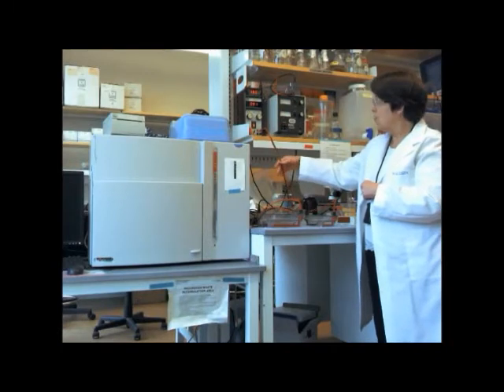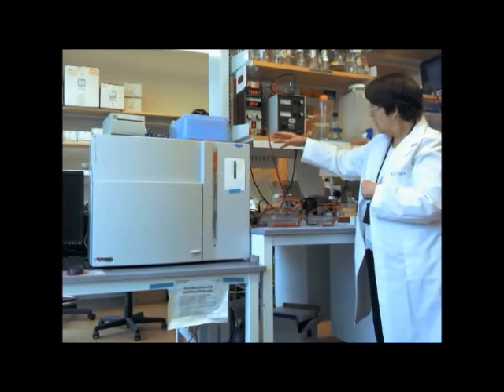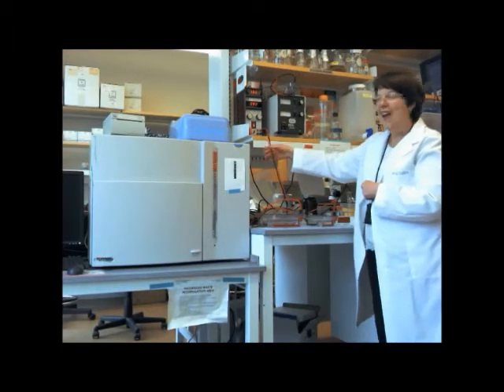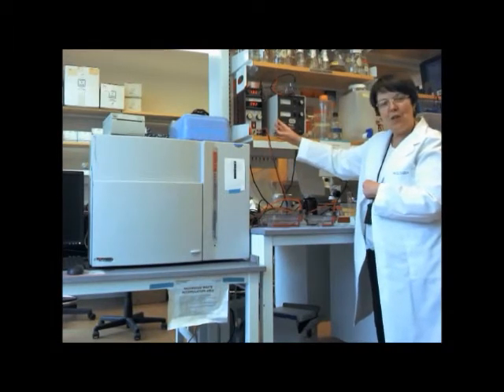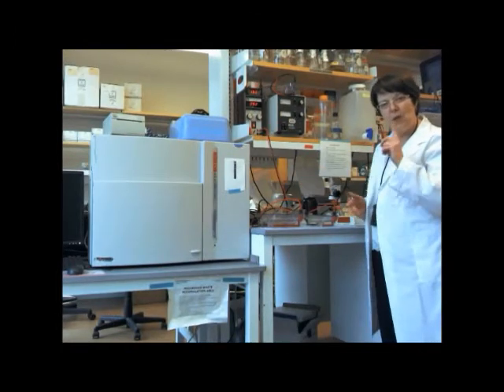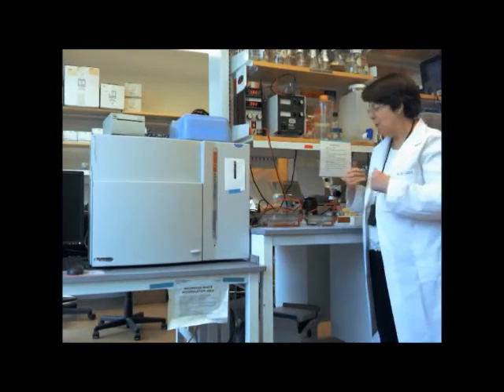I think you can see these cords here. This is connected to this apparatus. This gel is actually running, I just realized. And so, when we turn on the current, the molecules move from the top of the gel to the bottom. So the first question is, why are they moving?